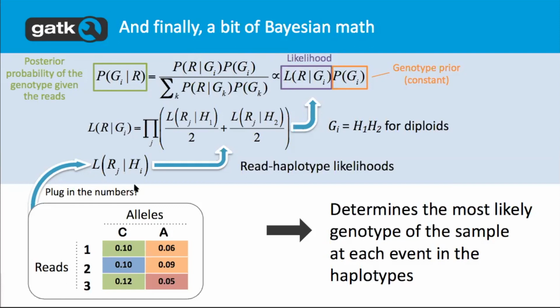Chromosome-specific ploidy. I'm not sure that's currently possible. I think you would have to do separate runs of the program. Can you say that a little louder, please?